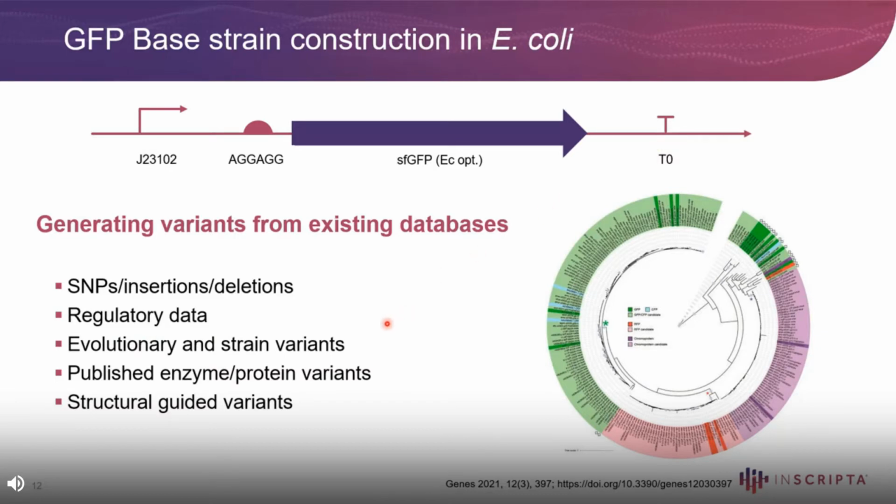that protein. So you can do SNPs, you can do insertions, you can do deletions, you can target the regulatory region or use regulatory data. You can use evolutionary and strain variants, any published enzyme or protein variants, or you can do structural guided variants.